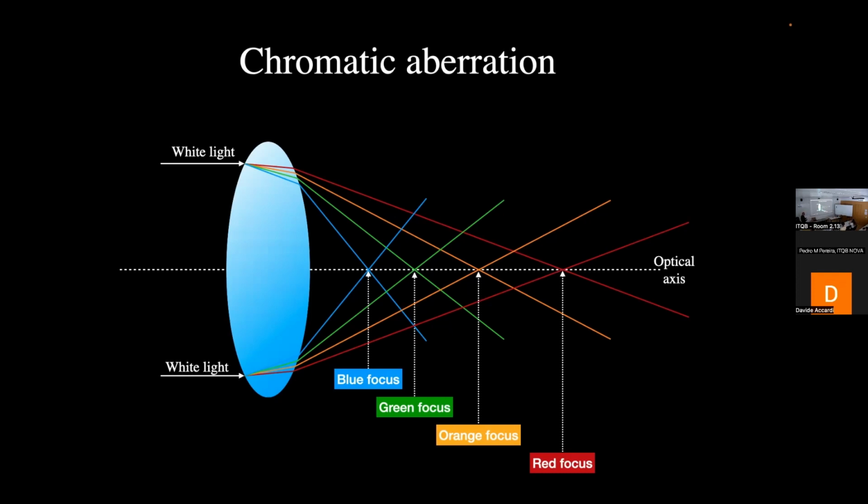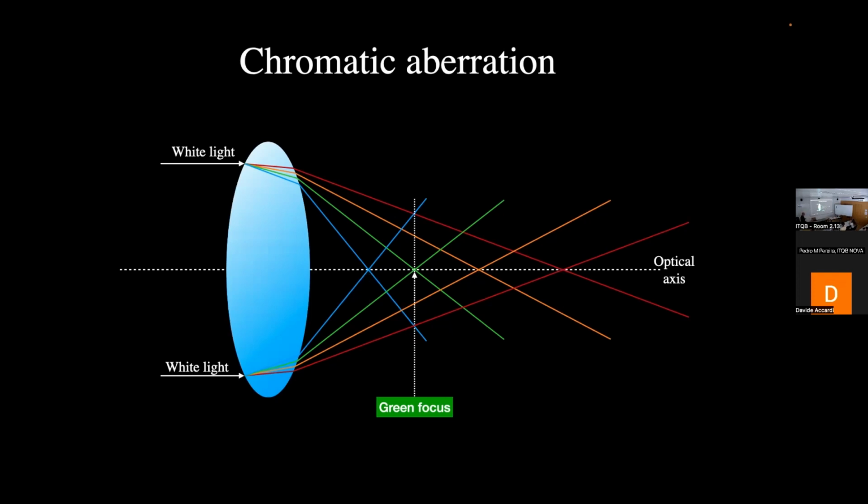And you might think, okay, but it's a Z problem. It's also in X, because if we consider only the focal plane identified by the green wavelength, the image in X and Y will appear like this. We will have our structure in focus in green in the center. Then we have an orange disk due to the defocused light that comes from the orange wavelength. And then eventually a magenta disk due to the overlapping of the red and blue, because if you put red and blue light together, the result is magenta. So you will have a green in-focus structure with this halo of defocused light around. So your images will be really poor, and your localization on different wavelengths will be really terrible.